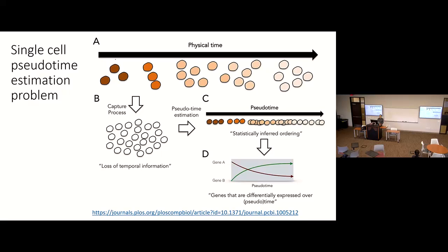If you have multiple samples in different colors, then you can put the early stage of cells you collected from sample 1 here, and you know those are sample 2, so then you have time.